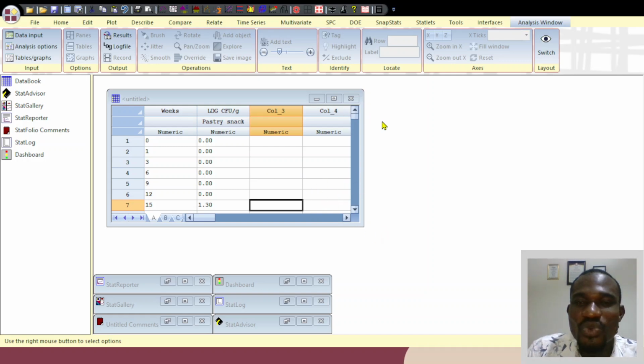confidence level. We are not selecting any transformation, but alternatively, you can choose transformation if you are sure of how your graph should be like. But for now, we are not choosing any. We'll just go to OK. Or you can decide to choose. If you want to choose, I would advise you choose the linear because for a shelf life plot, if it's done very well, you should have some sort of linear curve. But it all depends on the property of the material. Sometimes you have the actual microbial growth curve, and that looks more like a polynomial curve sometimes. So let's just leave it at none.